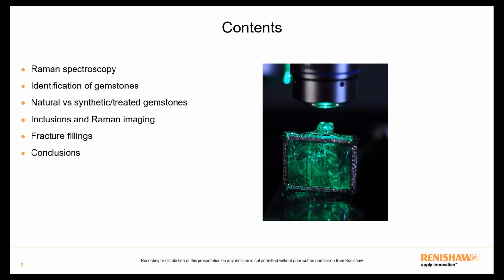We'll start by giving a simple overview of the Raman technique and some of the important considerations when analysing gem and geological materials. Important features of a Raman product for this application area and with the context of photoluminescence. Riccardo and I will then detail many of the commonly encountered scenarios faced by gem labs and researchers, looking at the identification of gems, authenticity and certification, inclusions, and fracture fillings.